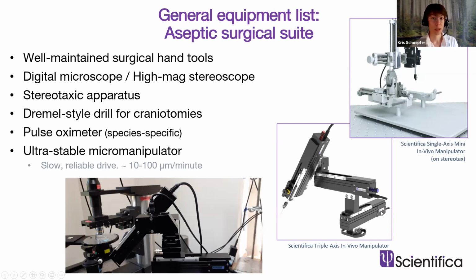Ideally, you'd like something that is electrically silent, especially if you're doing acute recordings, right? If you're going to be recording right there in the surgery suite. And so something that you can essentially pre-program in, and it will have a motorized drive. So you click go, you set up your probe as you need. You essentially click go and it will drive reliably to your end destination.